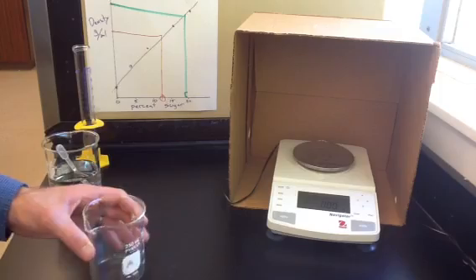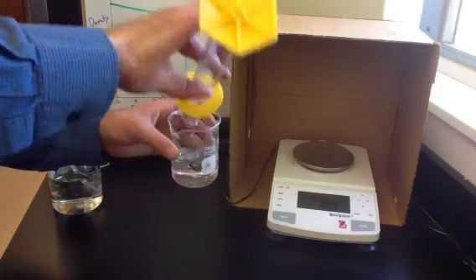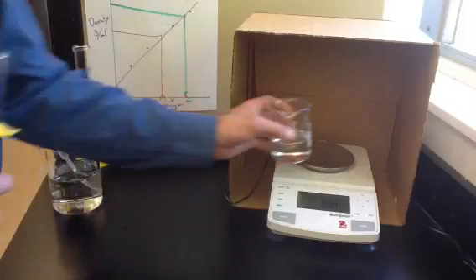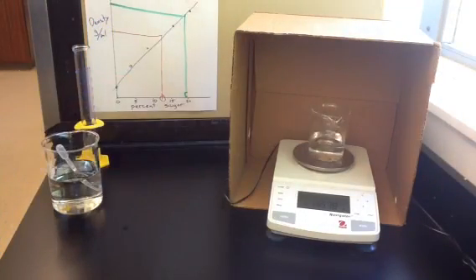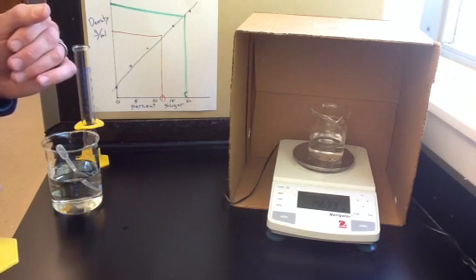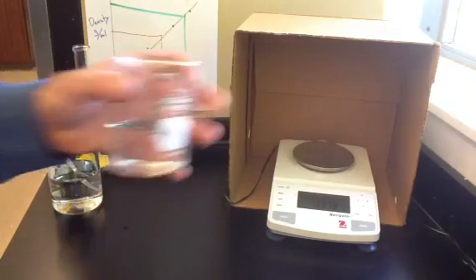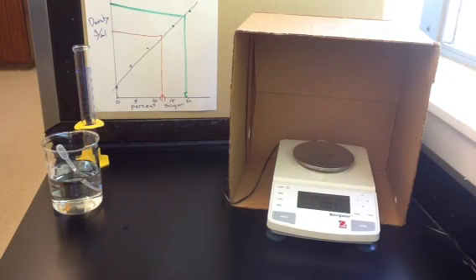And now we'll go on to the 10%. So this one contains 10% sugar. Again, we have 100 milliliters of it. We'll put it into the same beaker. It says 196.34. That was 10%.